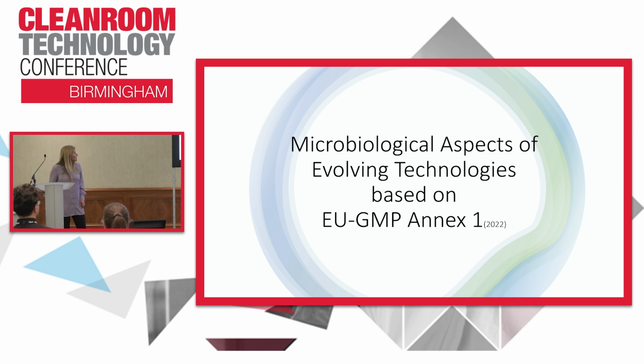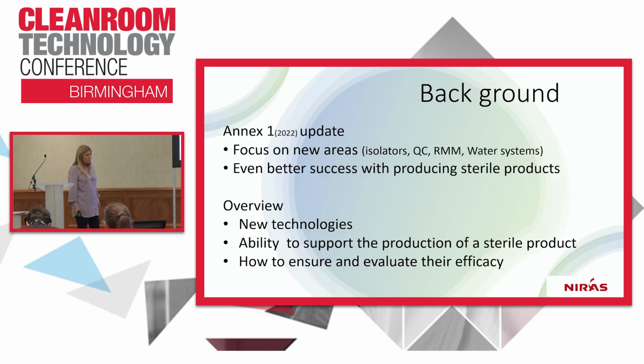I will give this presentation on the microbiological aspects of these new technologies we see in the Annex 1. So the background is we have this Annex 1 update with a focus on a lot of new technologies that we did not see in the 2008 version. We have the RMM, rapid methods, we have isolators with water system, etc. And the purpose for this new big annex is that we want a better success, I guess, with producing our sterile products.